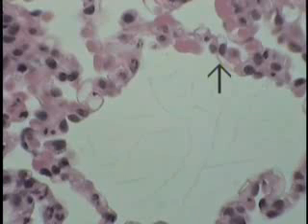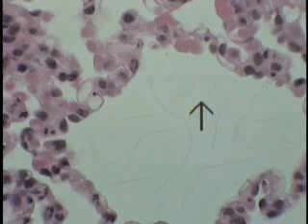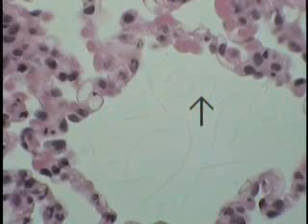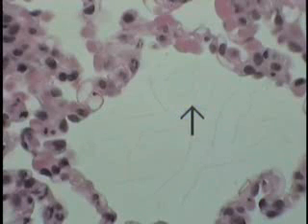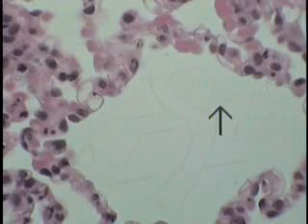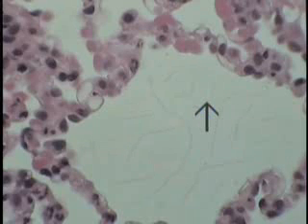It can be either 3 or 5 layers usually. An epithelial barrier lining the lumen of the alveolus, that is the type 1 pneumocyte. Its basement membrane, perhaps the basement membrane of the endothelial cell, and then the endothelial cell cytoplasm itself. Usually there's a fusion of those two basement membranes. If not, there's a little connective tissue interval between the two, and you will end up with a 5-layered system, but it's all extraordinarily thin.